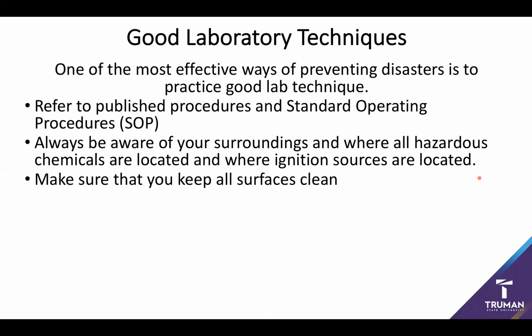And very much associated with this, try and make sure that you keep all of your surfaces clean, because it's very easy for you to miss a hazard that is there as an impurity in your surroundings.